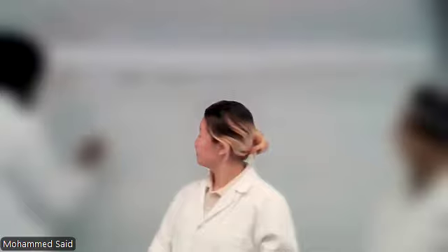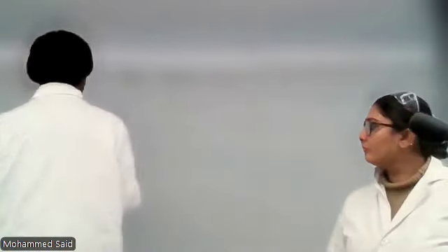So if you have 35 dots or 35 plaques at 10 to the negative 5 plate, you're multiplying by 10 to the power of 5. 10 to the power of 5 times 35 is going to give you 3.5 million PFUs or plaque forming units per mil. Keep note of units. Questions? Yes.